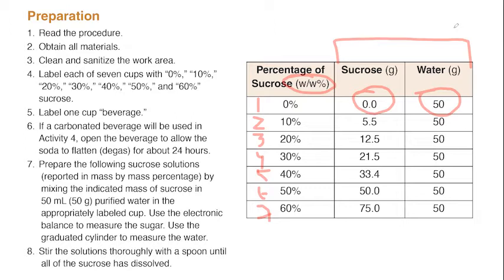W divided by W%. What do you think the W stands for? Isn't it the sucrose over a solution of water? But what does the W stand for? Is it weight? It's the weight. That's right. Excellent. That is a weight by weight percentage. So basically what we're saying is that it's by weight, not by volume.